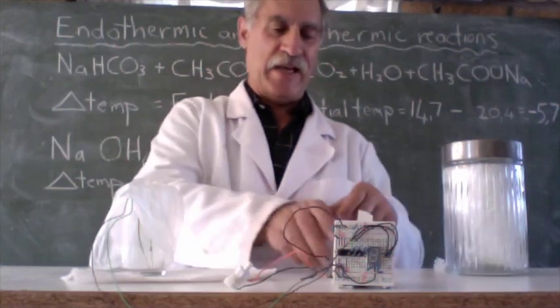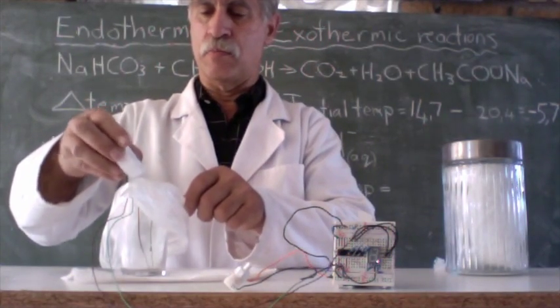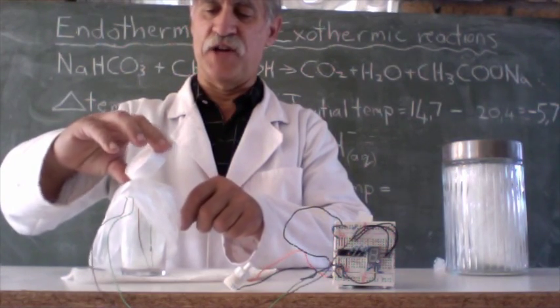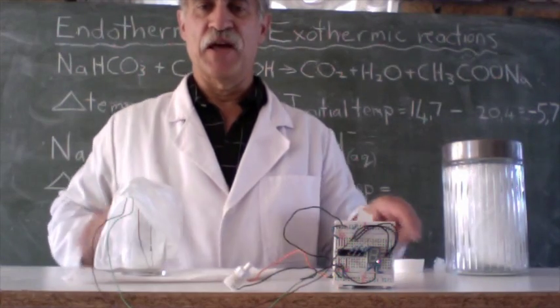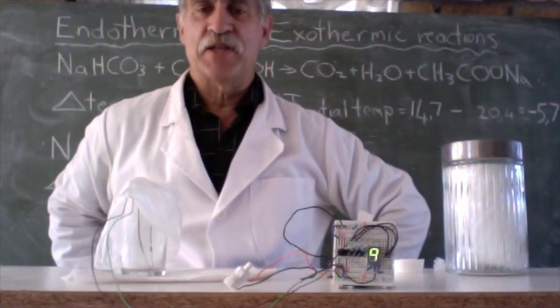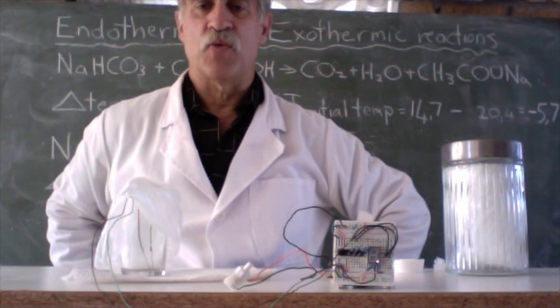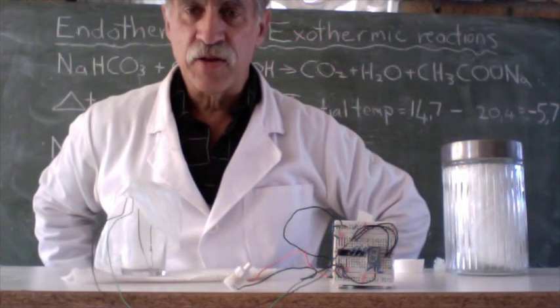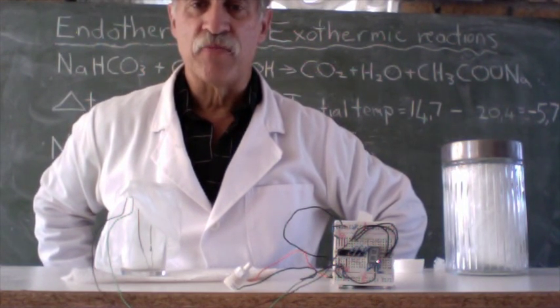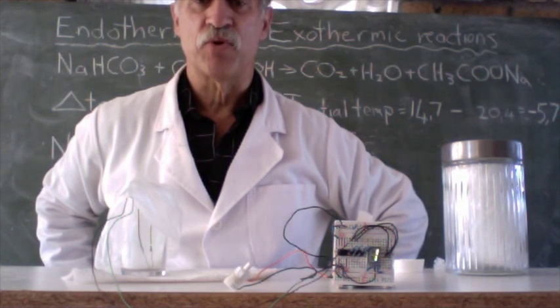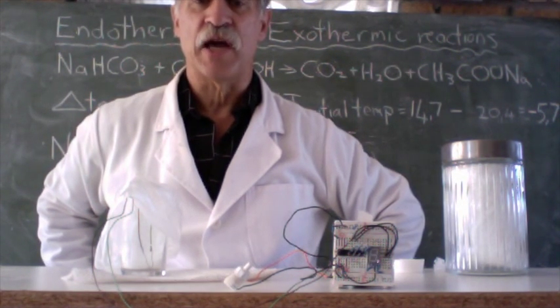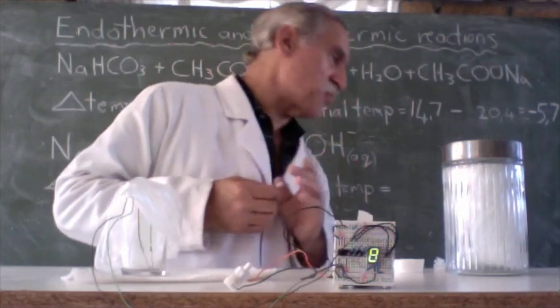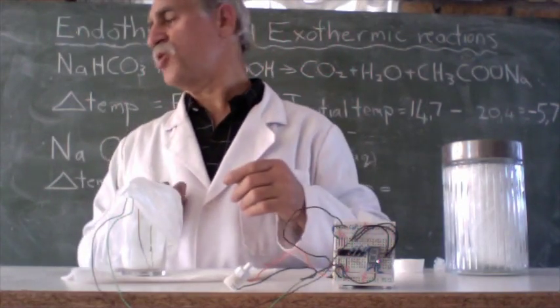Let's start throwing some sodium hydroxide into the water and see what happens to the temperature. So let's switch on. 27.4, 29.7, 31.5, 33.9, 35.7, 37.1, 38.4, 39. So do you see that the temperature is rising?